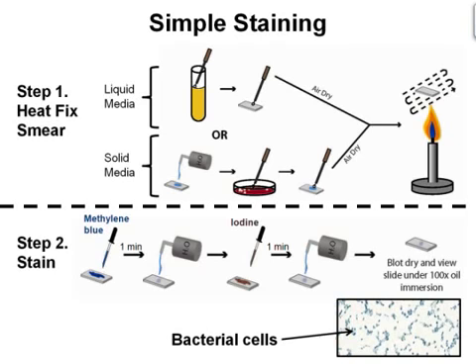Pick up the slide by one end and hold it at an angle over the staining tray. Using the distilled water wash bottle, gently wash off the excess methylene blue from the slide by directing a gentle stream of water over the surface of the slide. Wash off any stain that got on the bottom of the slide as well. Saturate the smear again, but this time with iodine. This will set the stain. Wash off any excess iodine.